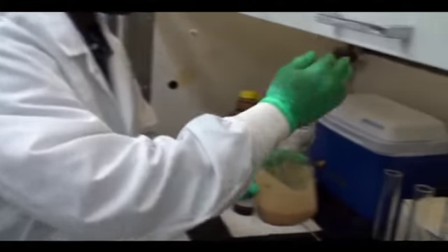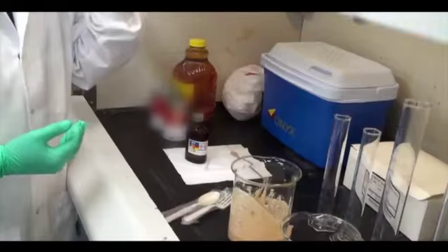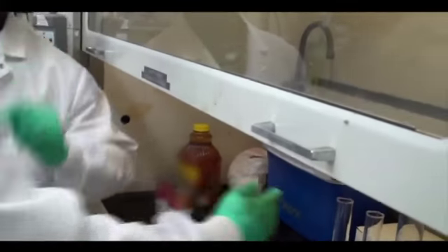Pretty pungent smell. So what's going on? We're under... what did you call this thing? The hood? The vent hood. And that's to take away the stink? Not to take it away, but not to let it out. Not to let it out, so we don't have to smell it. Exactly. And you put the chemicals in already? One drop of each one? It's already mixed together.